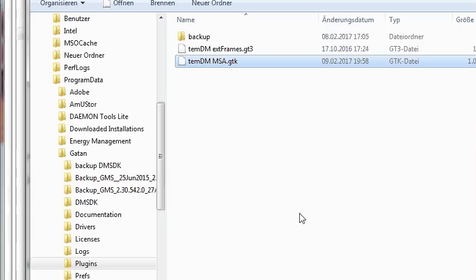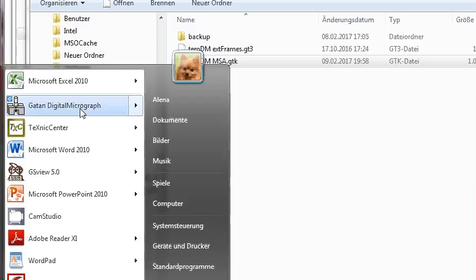Later, if you would like to uninstall it, just erase this file. Also not difficult. Good. Now let's start Digital Micrograph.